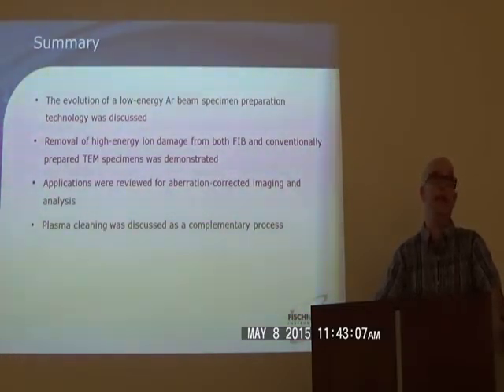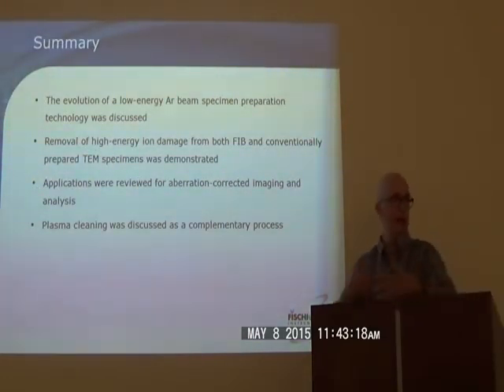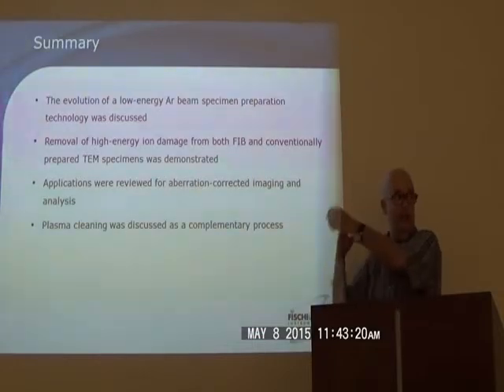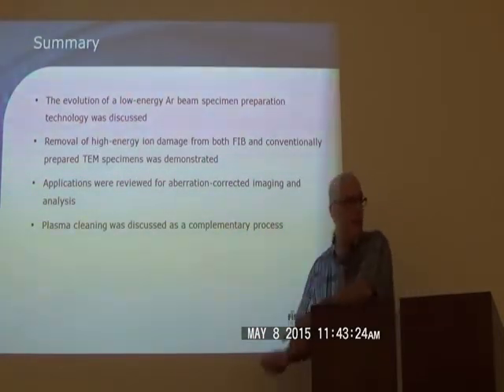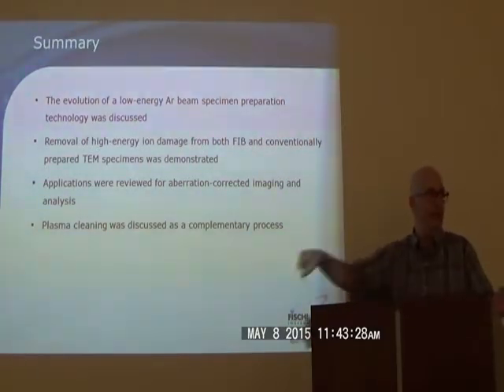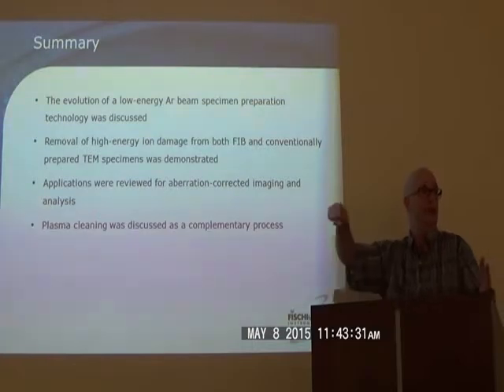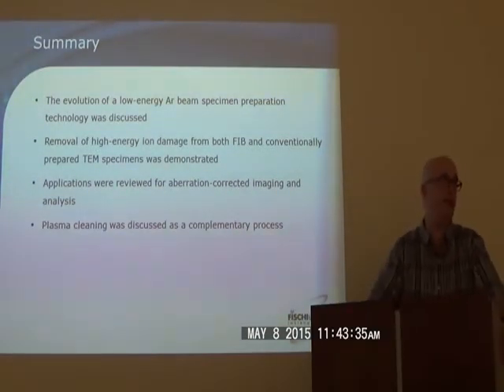We've actually made a vacuum transfer device or inert gas transfer device for the 1040, so that you could take the existing holder out to the load lock and just attach, and then go to a dry box, or a box under inert gas, and transfer to the TEM holder. But a lot of folks would rather just take the sample on a TEM holder out of the Pico and then just put it right into the TEM, which we'll be able to do.